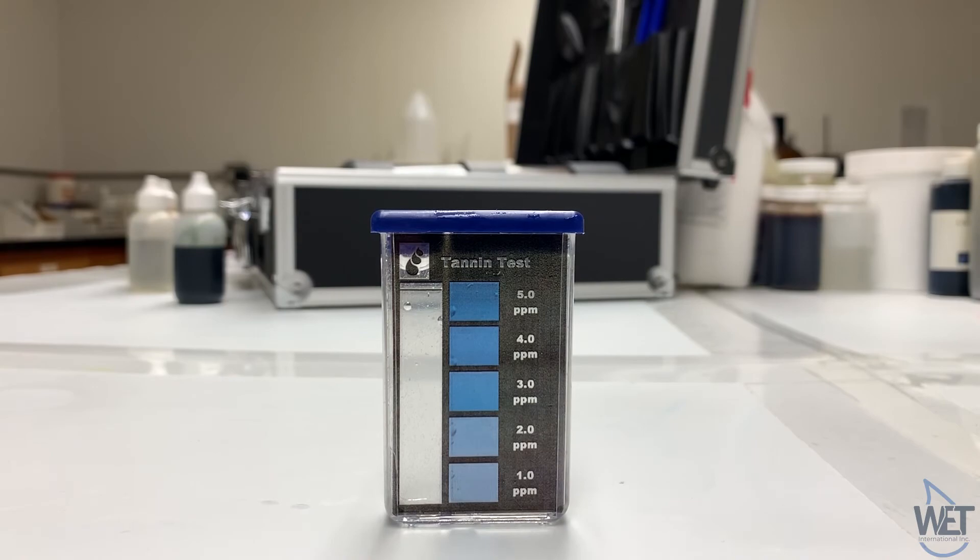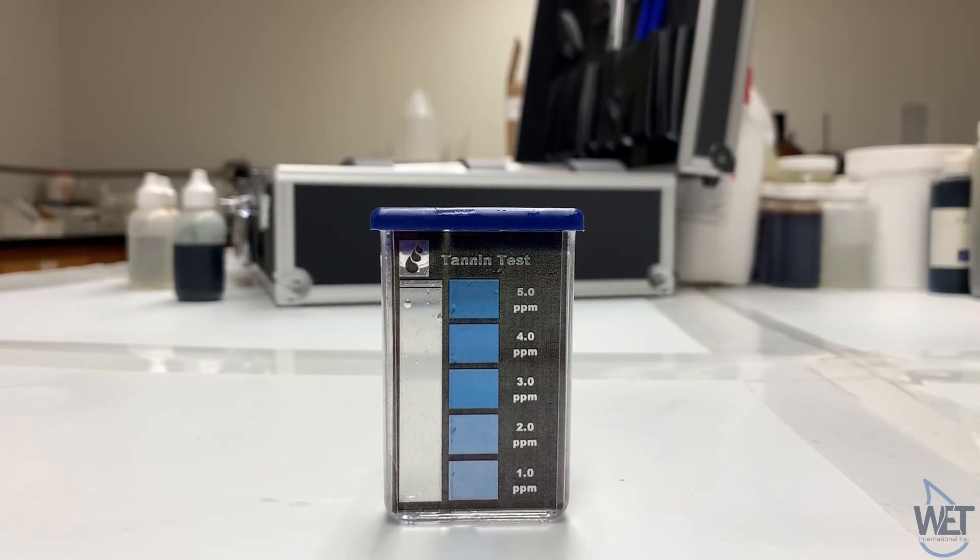And here is a sample that did not contain any tannins and therefore is still clear.